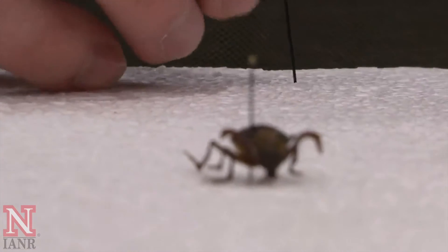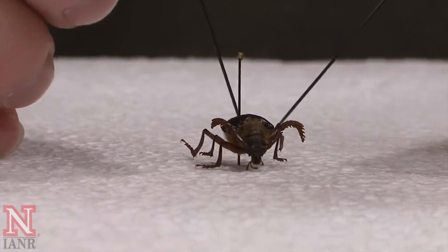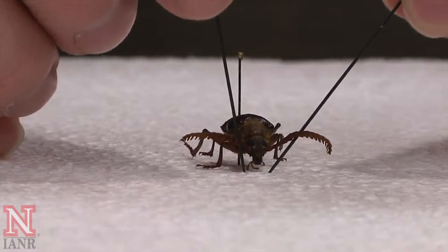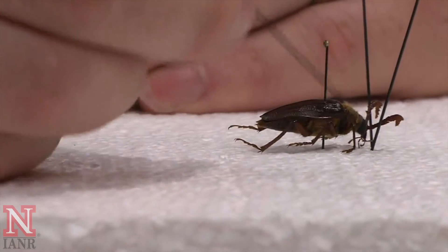Having put the beetle back in your styrofoam, begin to use pins to position the antenna and the legs into lifelike positions.